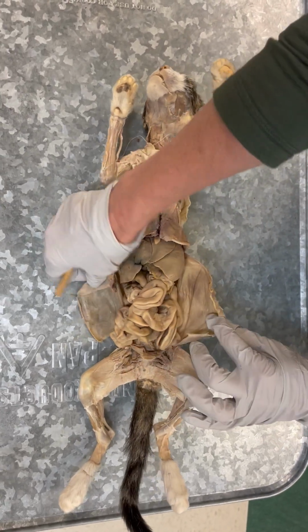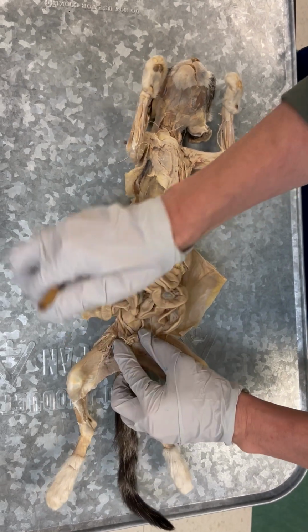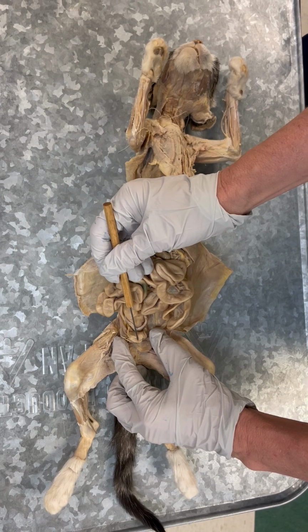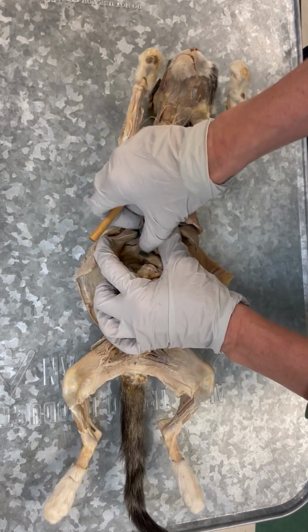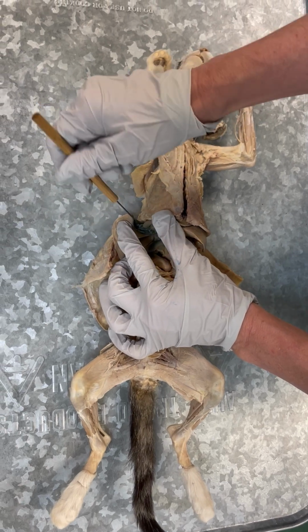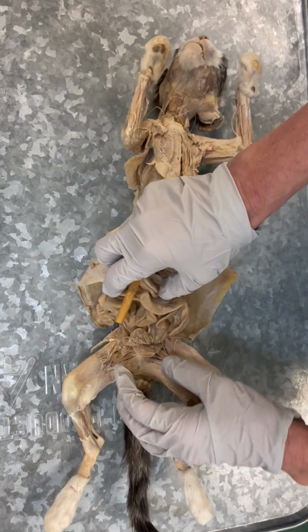Okay, so when you open up the cat, the first thing that you'll see down here is the urinary bladder. You have to call it the urinary bladder because it's not the only bladder the cat has, because the cat also has a gallbladder, which is this here that's embedded in the right lobe of the liver, okay?